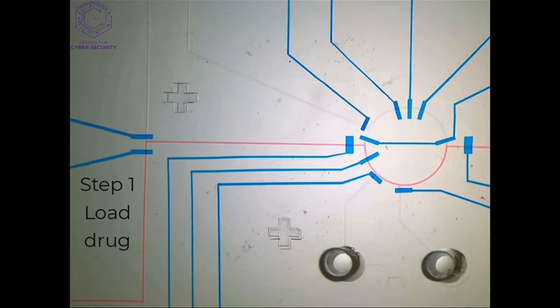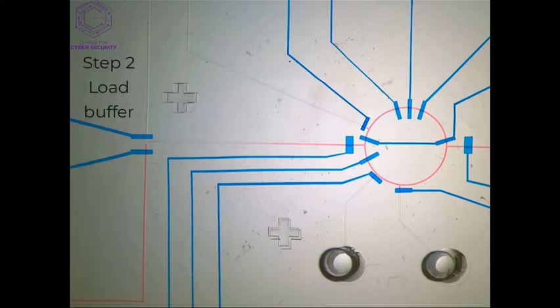Sample is loaded into the rotary mixer. Buffer is loaded to replace the bottom half of the mixer.